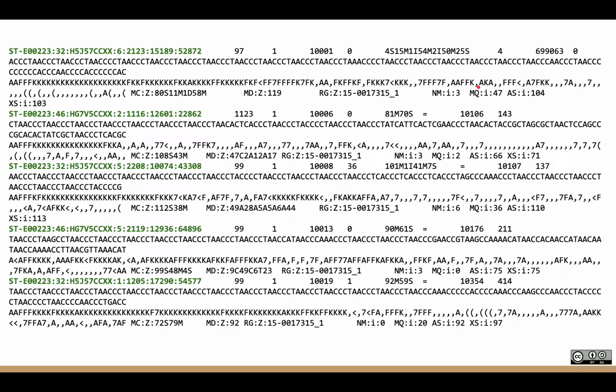So that was especially pernicious if you're looking for things like mobile element insertions or structural variants, which was my entire postdoc. So I spent the first year of my postdoc trying to figure out how to detect chimeras and figure out what was real rearrangement versus artifact. Nowadays we use transposases to slam in those adapters, so there's no ligase, so chimeras are basically gone, which is really nice.